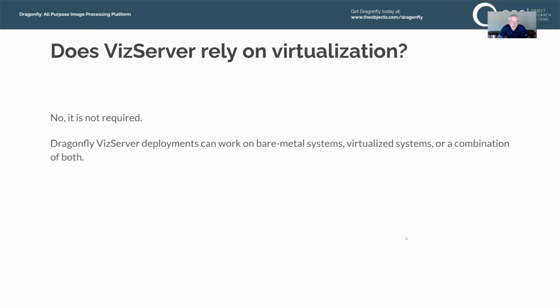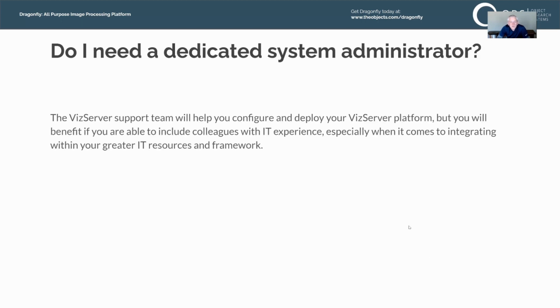Another IT-related question is, does VizServer rely on virtualization? The answer is it's not required, so no, it doesn't depend on it, but there are multiple configurations that can use virtualization. So Dragonfly VizServer deployments can work on bare metal systems, virtualized systems, or even a combination of both. And then the final question is, do I need a dedicated system administrator?